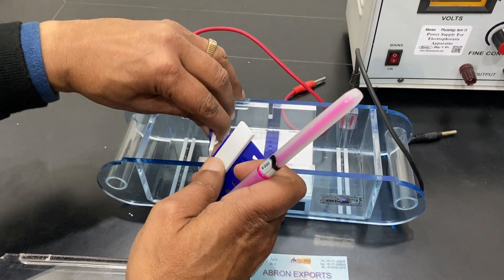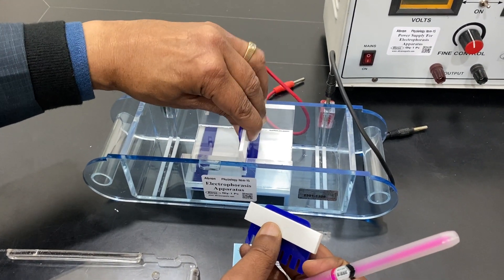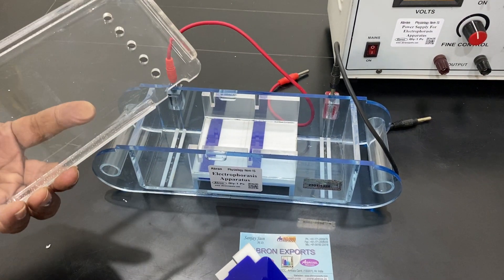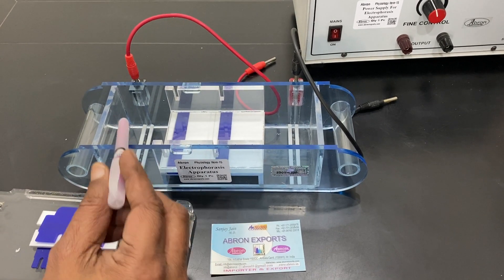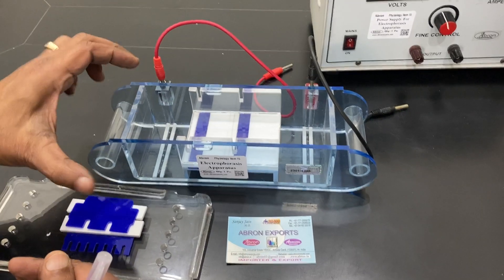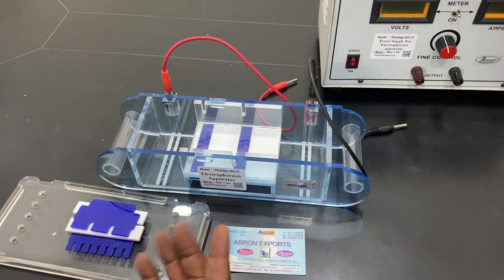One model comes with two cones only. Another model has a lid provided. There is also a multiple or larger model, approximately six inches by six inches or four inches by four inches. There are six to seven different models available.